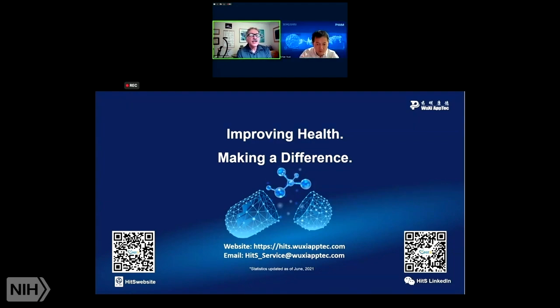Hi, Letian. Your high sequencing depth recommendation requires you to drive selections down to low numbers, for example, 1E7. This runs the risk of over-selecting to create a sample that is not usable. How do you approach getting this number right? So I think yesterday, maybe Svetlana already commented on that, depending on the protein.